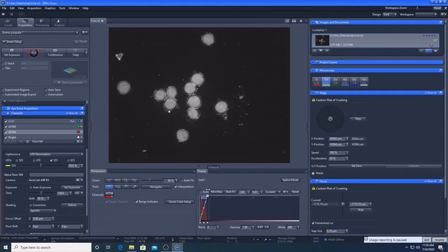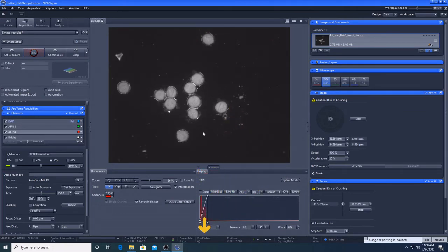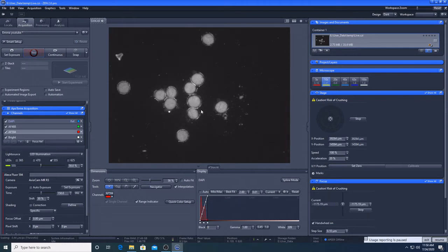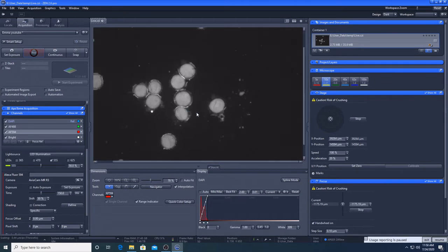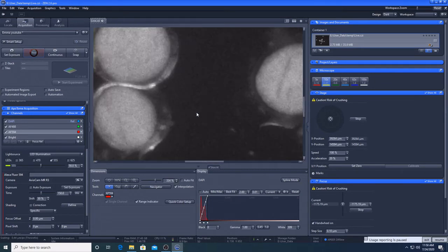For example, if I put this cursor here, the background value is 40. If I put the cursor at the centre of my sample, the value of the pixel is 176. If the question I was answering was, is this pollen fluorescing at 594, then I can prove that it is sufficiently different from the background to say that it is, even if the image is grainy and not particularly beautiful.